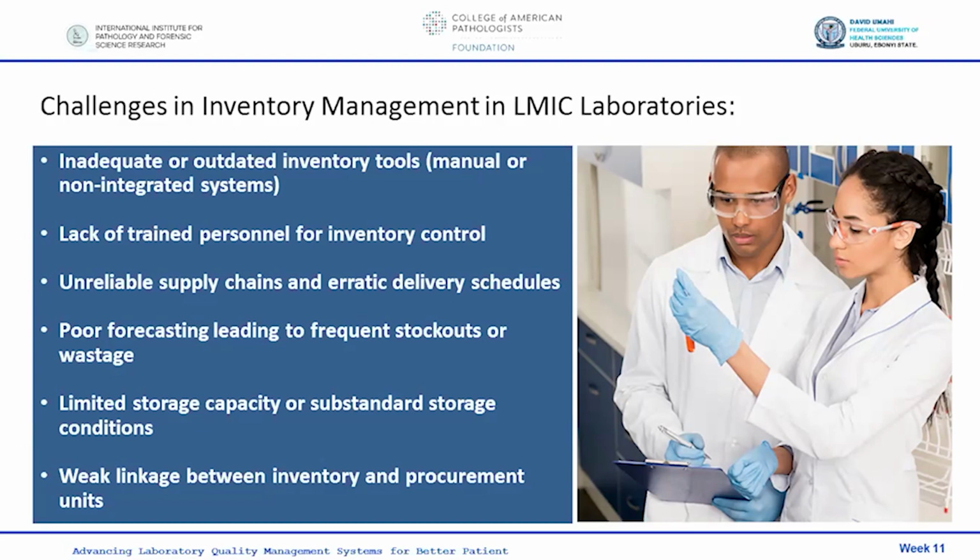Poor forecasting can lead to frequent stockouts or wastage. Limited storage capacity or substandard storage conditions is another challenge. Then weak linkage between inventory and procurement units is also another challenge, because they may not be in the same location. So it's usually a communication problem at times.